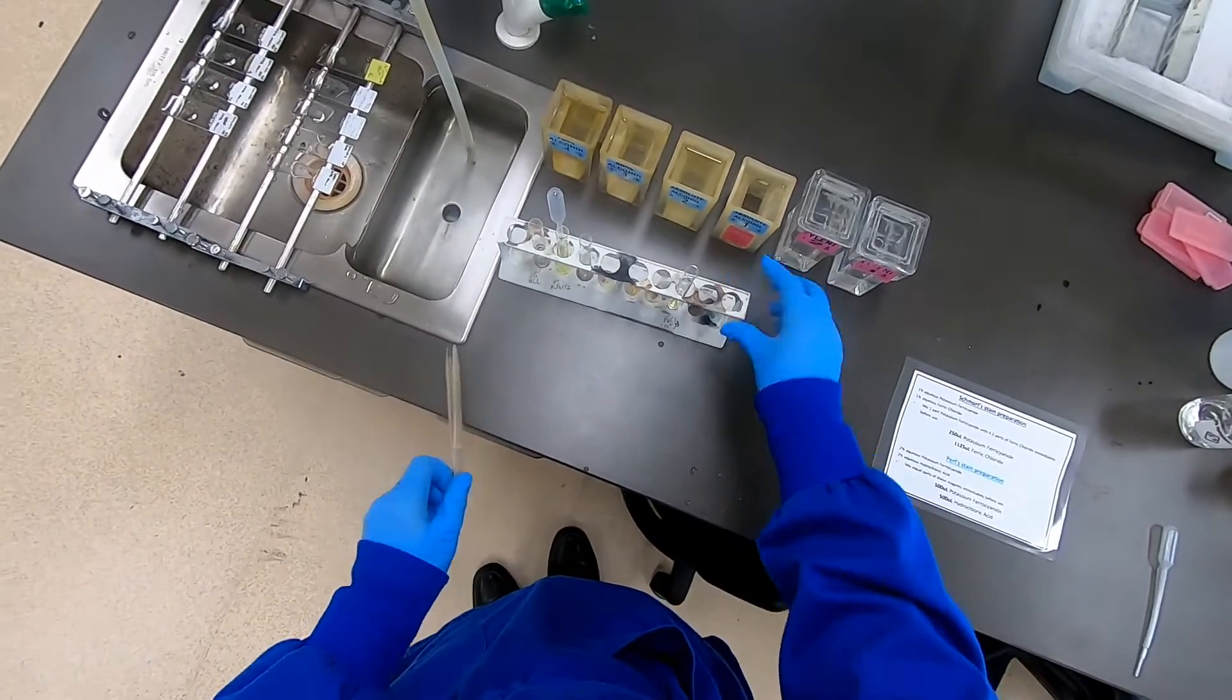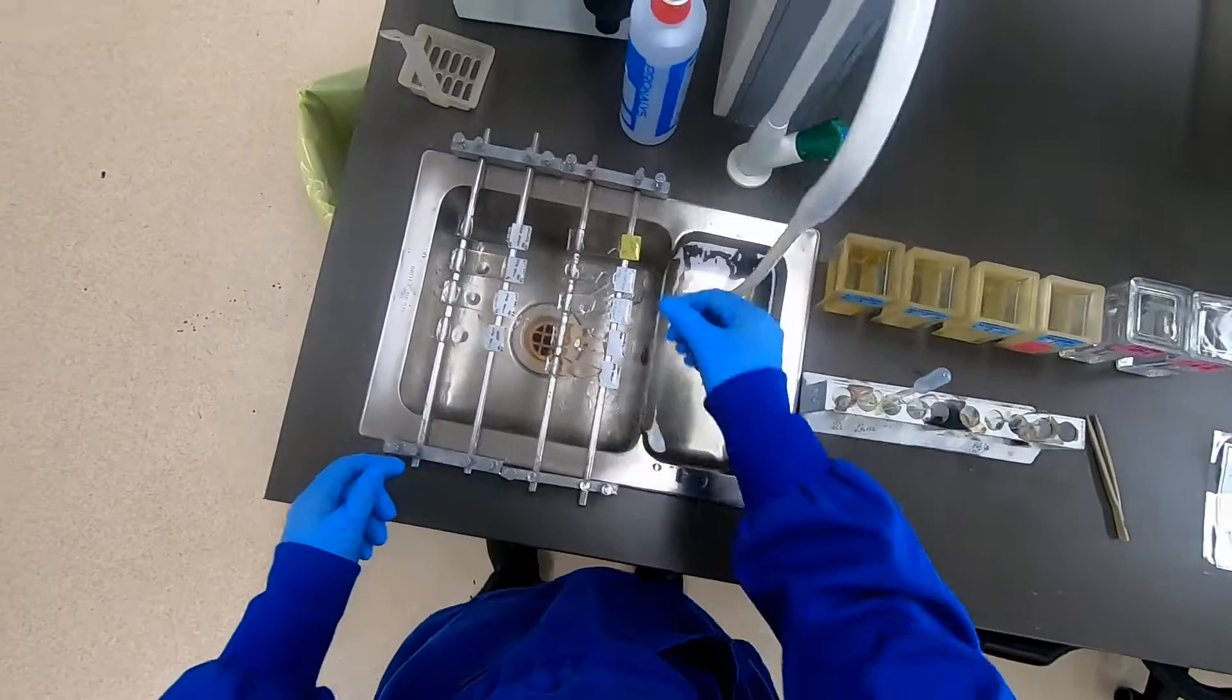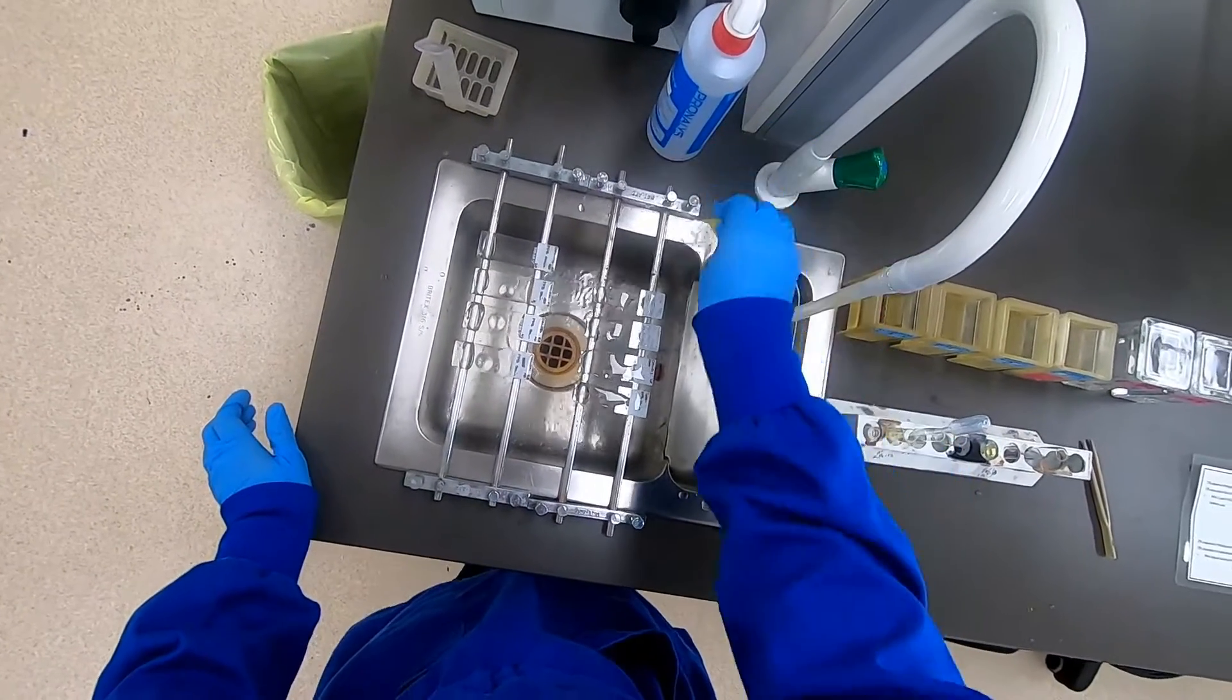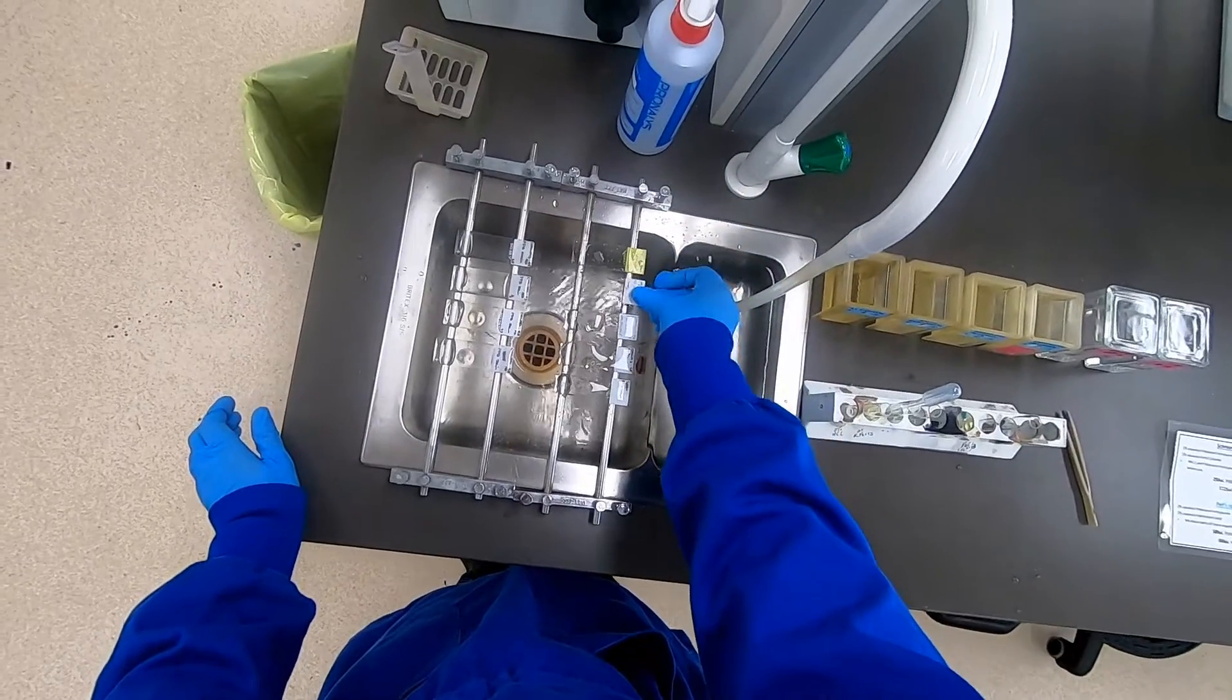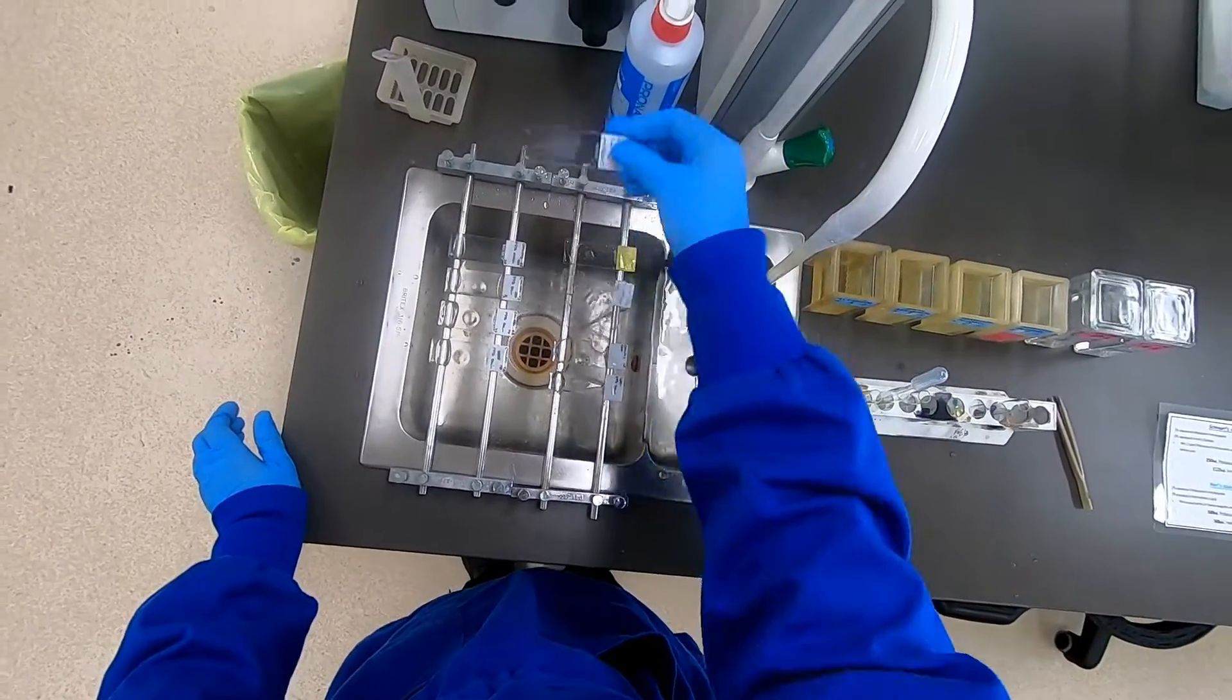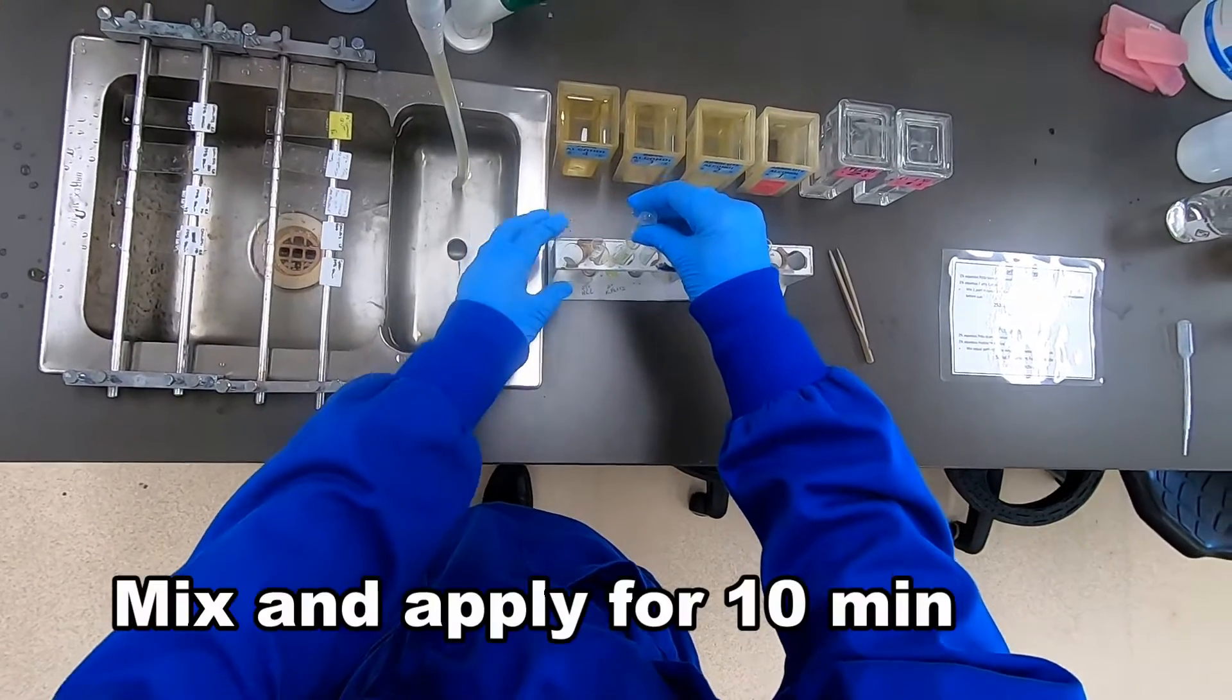It's best to prepare this fresh just before use. We'll simply now flick off the deionized water, and it is important to try and get most of that off so we don't dilute our stain too much.